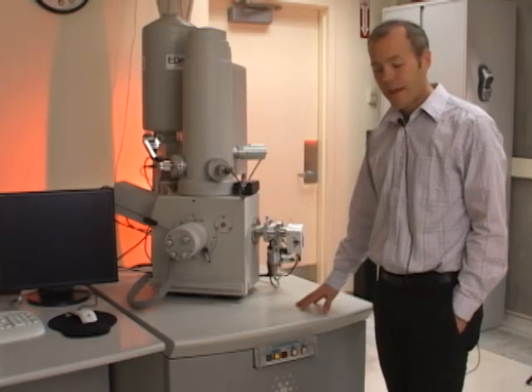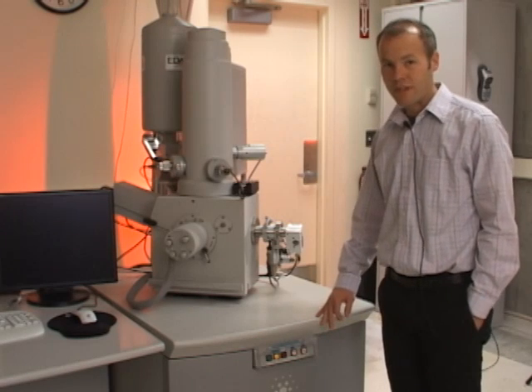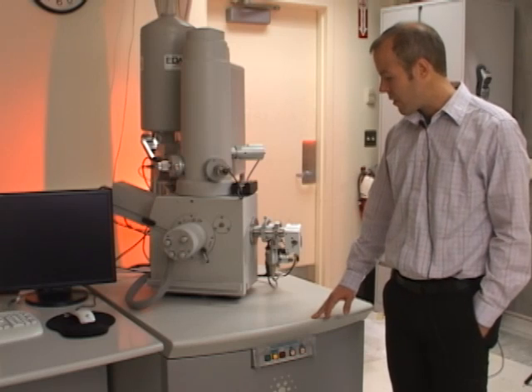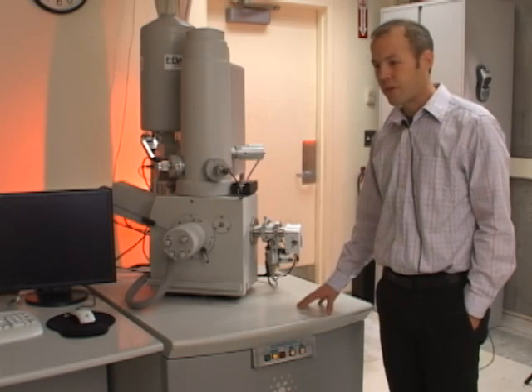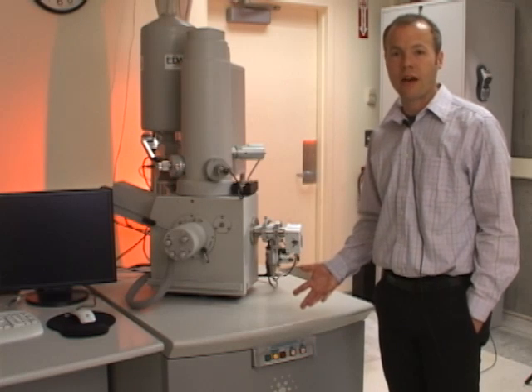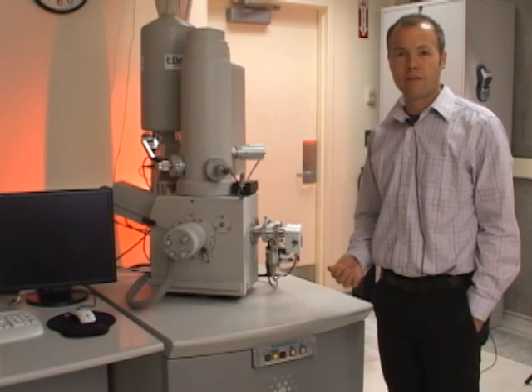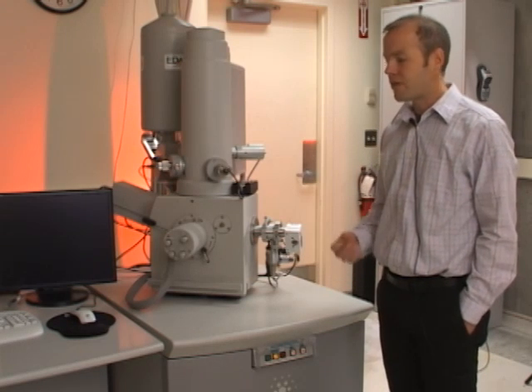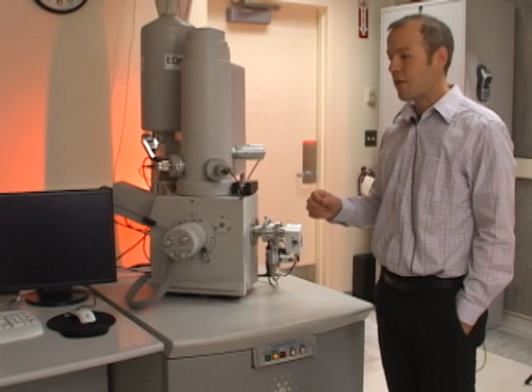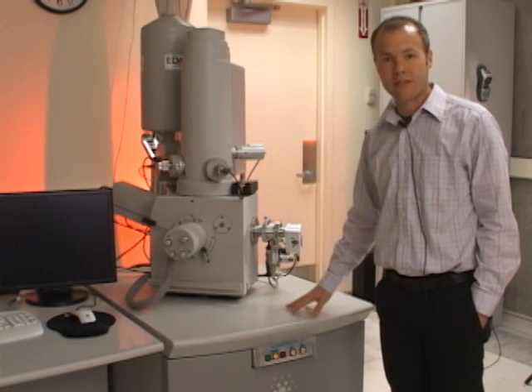In the table, across the front are the main power switches for the system. The user doesn't need to adjust these — they're only for maintenance purposes. Inside the table there's a turbo pump that helps pump the chamber down to high vacuum. The chamber pressure is on the order of 10 to the minus 5 millibar, achieved using two pumps: the main pump in an adjacent closet and the turbo pump in this table.